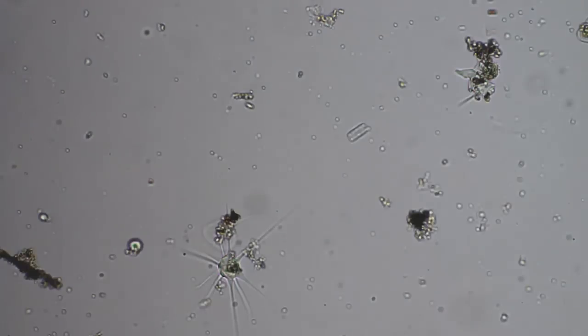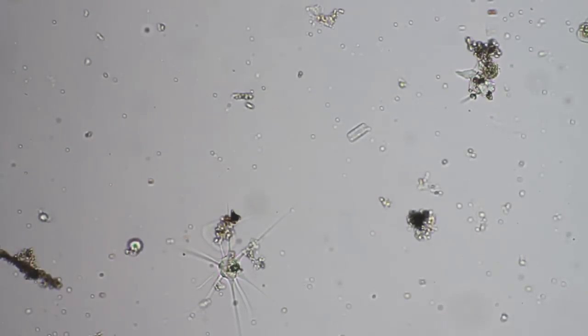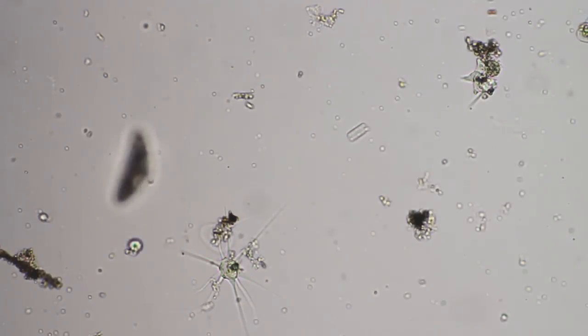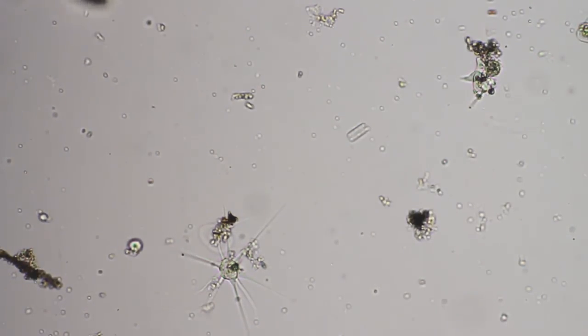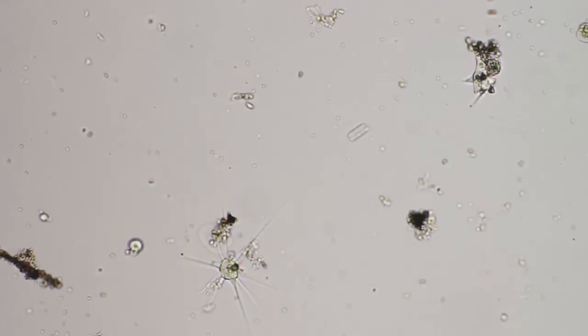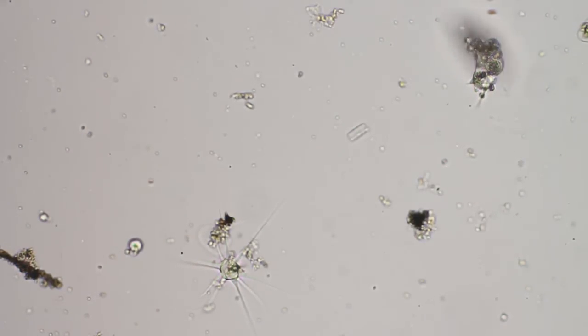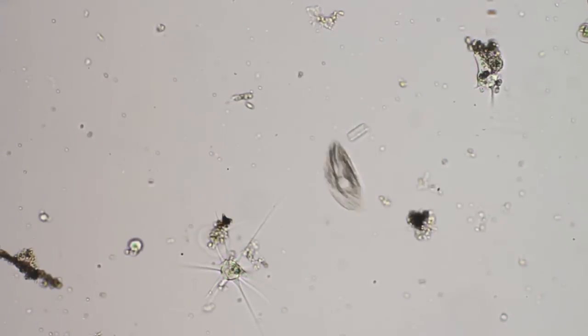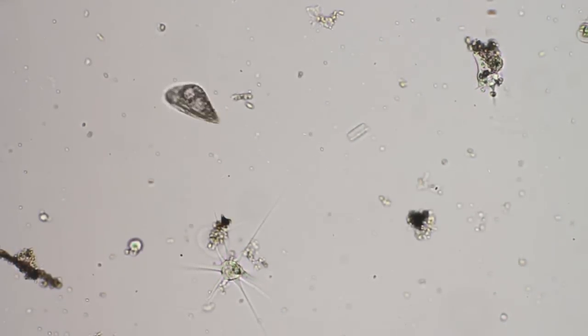I'm doing some light adjusting here. This is the iris on the condenser — the bright field condenser. I'm trying to adjust something.